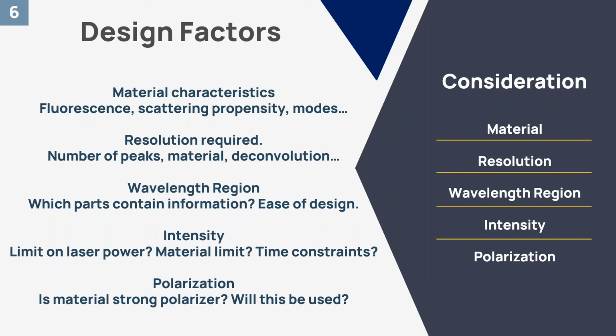If we move on to the next one here, now that we know a little bit about what a Raman spectrum would look like, it's worth considering some of the design factors that go into choosing the right tool for the task, essentially. And the first point we would recommend starting at is looking at what the characteristics are of the materials we want to be looking at.